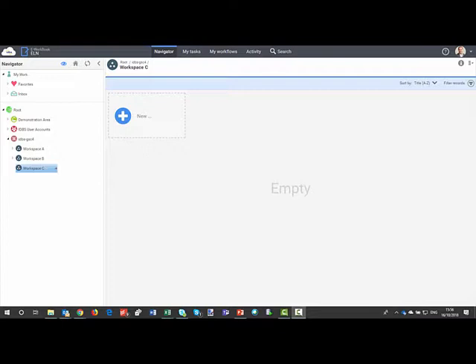You're looking at E-WorkBook version 10.3, and on the left-hand side you can see a hierarchy that's been set up, and we have three visible nodes: a demonstration area, some IDBS user accounts, which is the hierarchy we have set up here, and then this new icon that's perhaps unfamiliar, which is a collaboration icon, which represents a Connect instance that I can share to, and the workspaces that I've set up to be visible underneath this that I would want to share into.